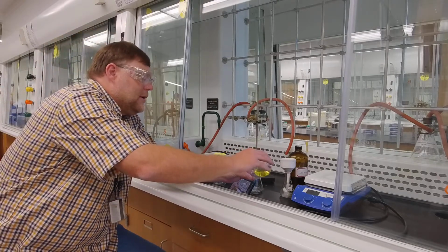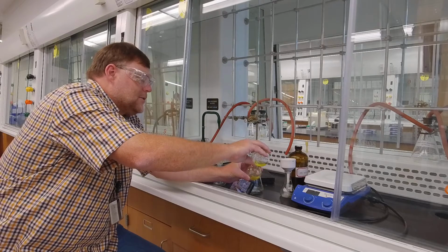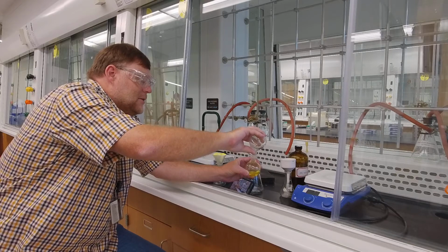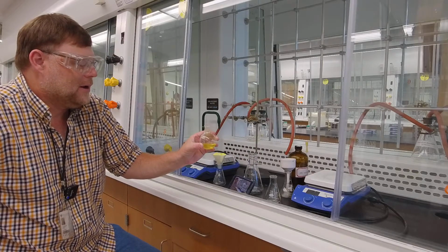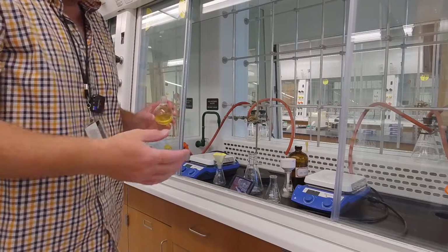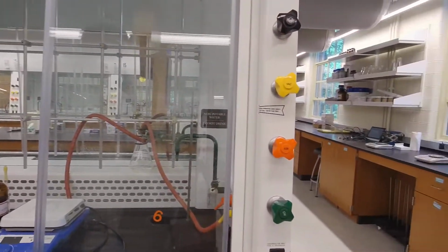So in the hood, I'm going to pour. You guys feel free to use a funnel. You probably should use a funnel. It occurs to me I should have used a funnel. All right, so I've poured that solution into this round bottom flask, and now I'm going to take it over to the rotovap. So you see here I'm at the hood. I'm simply going to spin slowly.